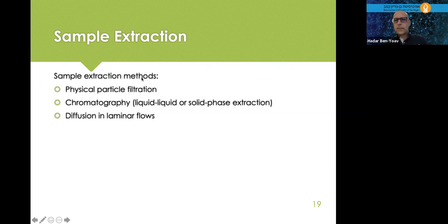Chromatography, liquid-liquid, solid phase extraction, and also diffusion in laminar flow. We know molecules have different diffusion coefficients or diffusion rates. You can use this diffusion rate, for molecules that diffuse faster than others, to extract them. Actually, we will see a very cool example, called the H filter, next Monday.